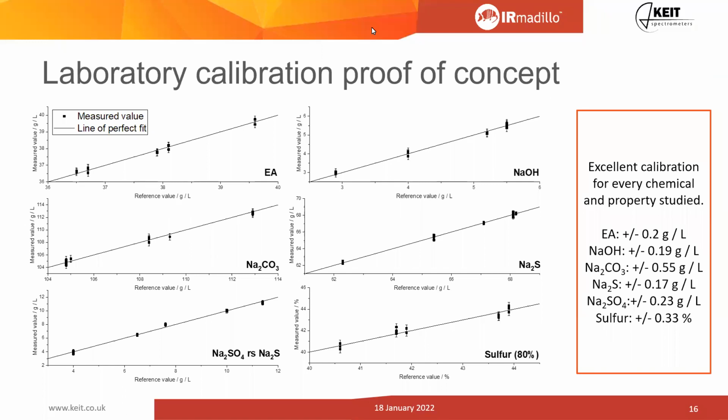Thank you. Here's a two-part question. Do you have any issues with color? And could I do an install in white or black liquor? So color's not a problem. Mid-infrared doesn't really see color. If we were using a UV-vis instrument, it would, because obviously that's visible light, so we're looking at color. For us, we don't see the color, so it's not a problem. In some instances, in somewhere like the edible oil space, people actually want to measure color. In that case, we do it by measuring the chemicals that cause color rather than color itself. In pulping, it's not really a problem. Green or white liquor doesn't really matter either way.